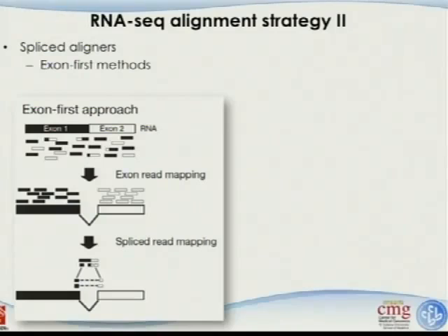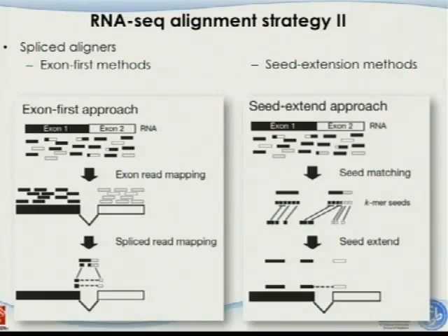And the next stage is you further work on the remaining reads. So the way to do that is people just separate those unmapped reads into smaller chunks, and then each individual one is individually mapped and then further connected. So some people are doing that.